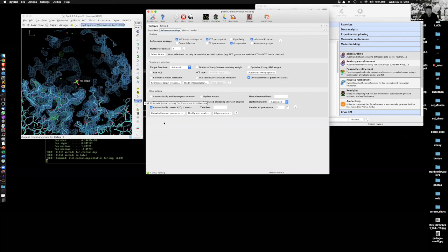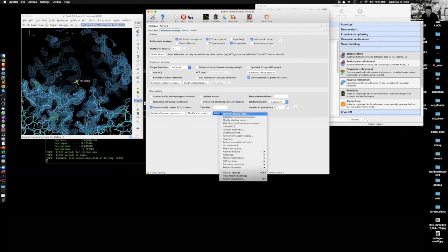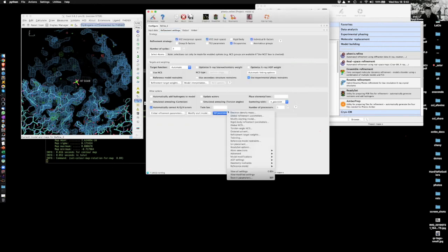And then the next question you ask is, well, how do I find that parameter, right? Well, you go to all parameters, and there's a lot of parameters that you can change here. Now, that still doesn't answer your question. Sometimes we say you need to change that particular parameter, and that's just a list of a lot of links to sets of parameters like this one. So what you can do is go and search parameters.